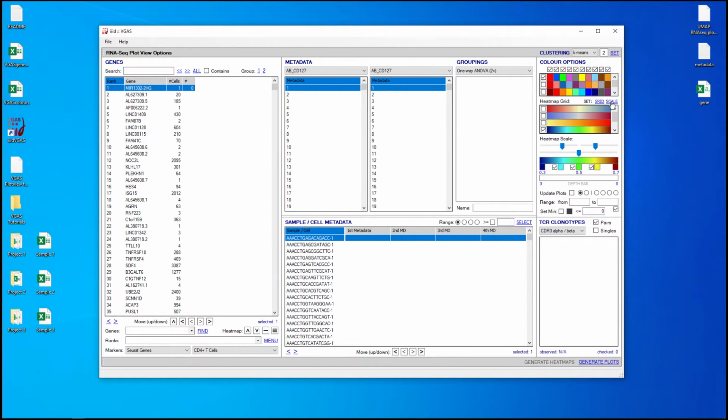The scale can encompass 3 to 5 colors using the 5 colored boxes located below the scale. Users can also drag the sliders to modify the scale. To save a scale as grid format, select Set Grid. This will add a palette that reflects the scale.